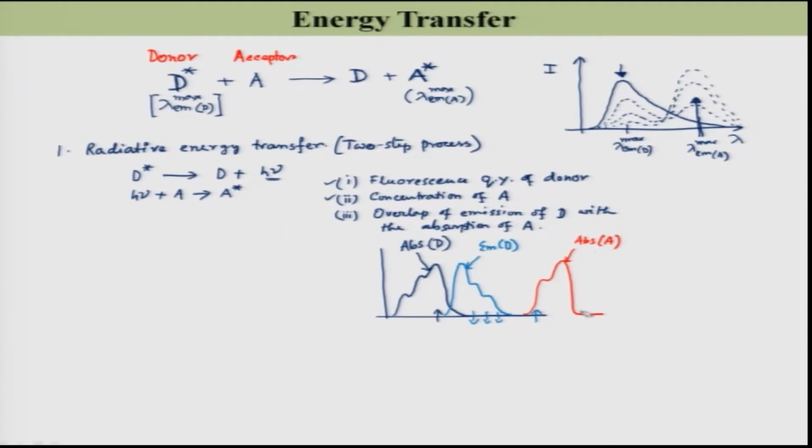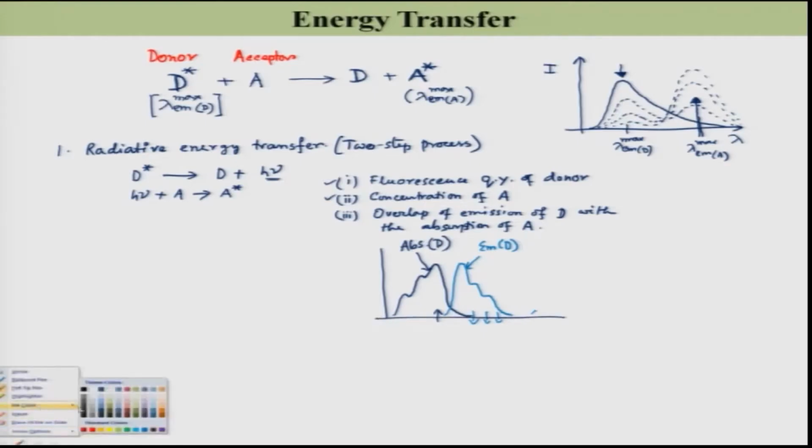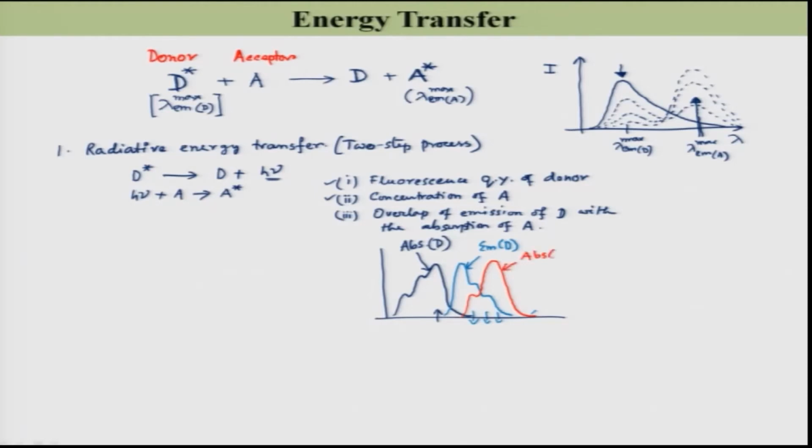However, if the absorption spectrum is not like this, but it is like this, this is the absorption spectrum of the acceptor.